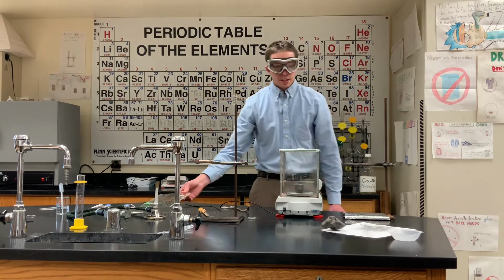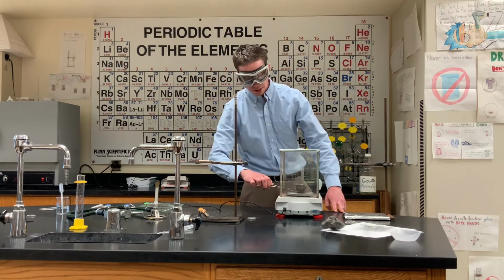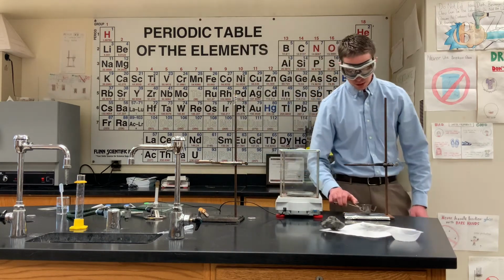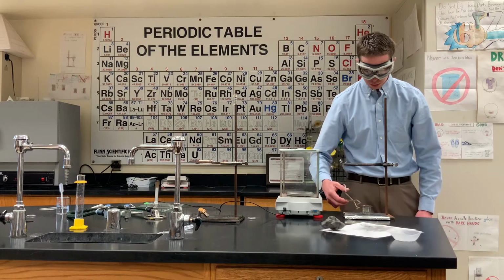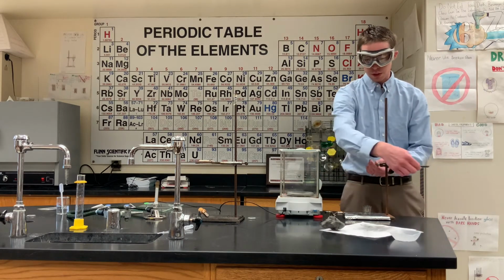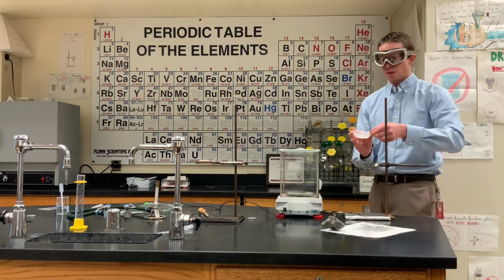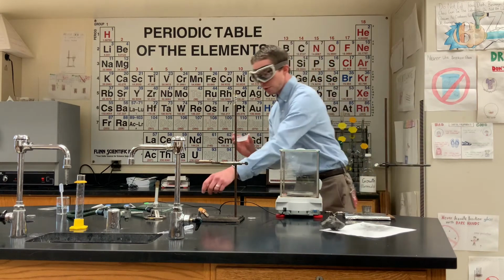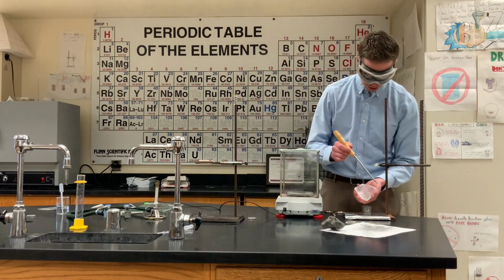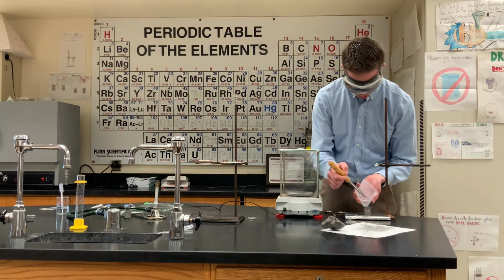Now, the next thing in the data table is to put the metal, the magnesium, that I've previously shined and cut up into the crucible. So, handling everything with tongs, move this ring out of the way. I've got my magnesium ribbon in this weigh boat here, and I'm going to have to very carefully use a scoopula to try to get as much of it into the crucible as I possibly can.